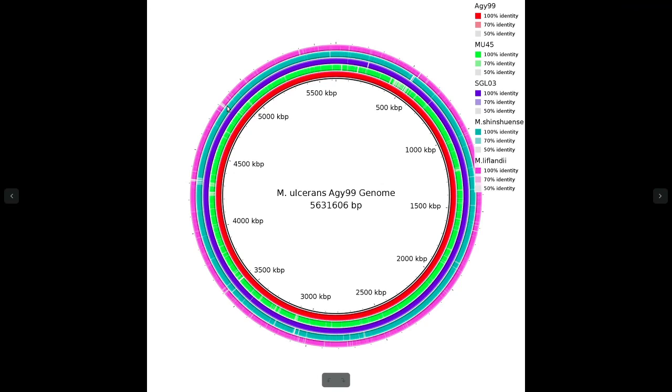So it could be that these sequences are not identical in terms of their percentage identity. It could be lower than 50, and that is why BRIG says it's not the same, so it marks it as a gap. Or it could be that it's not really there. Okay, so this tells us that there are gaps. You can look into it more with other types of analysis, maybe looking at SNPs or some other things. Aside from that, you could also use this visualization to answer other questions, which maybe we'll cover in some other video as well.